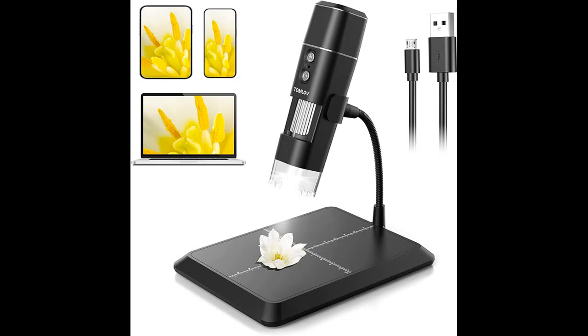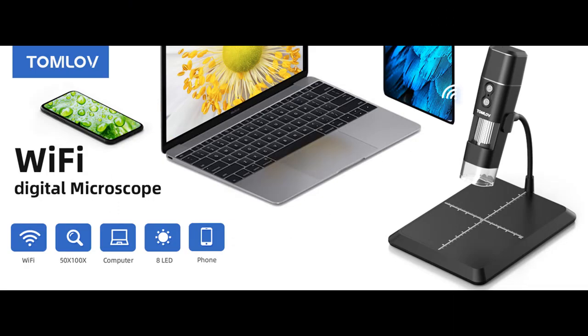Tons of fun outdoors. It comes charged and charges fast. This portable microscope can last 2 to 3 hours after fully charged. The microscope can be used without the holder, and the pocket-sized design makes it easy to carry around for outdoor fun.